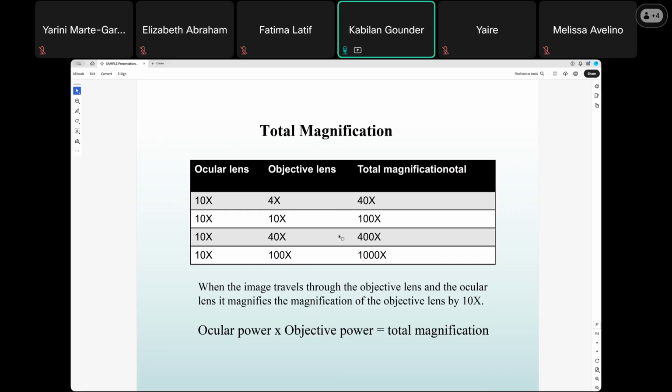When you take a picture in the software, you can calculate the original magnification, and that is the scale bar. That will give you the magnification when you took the images.